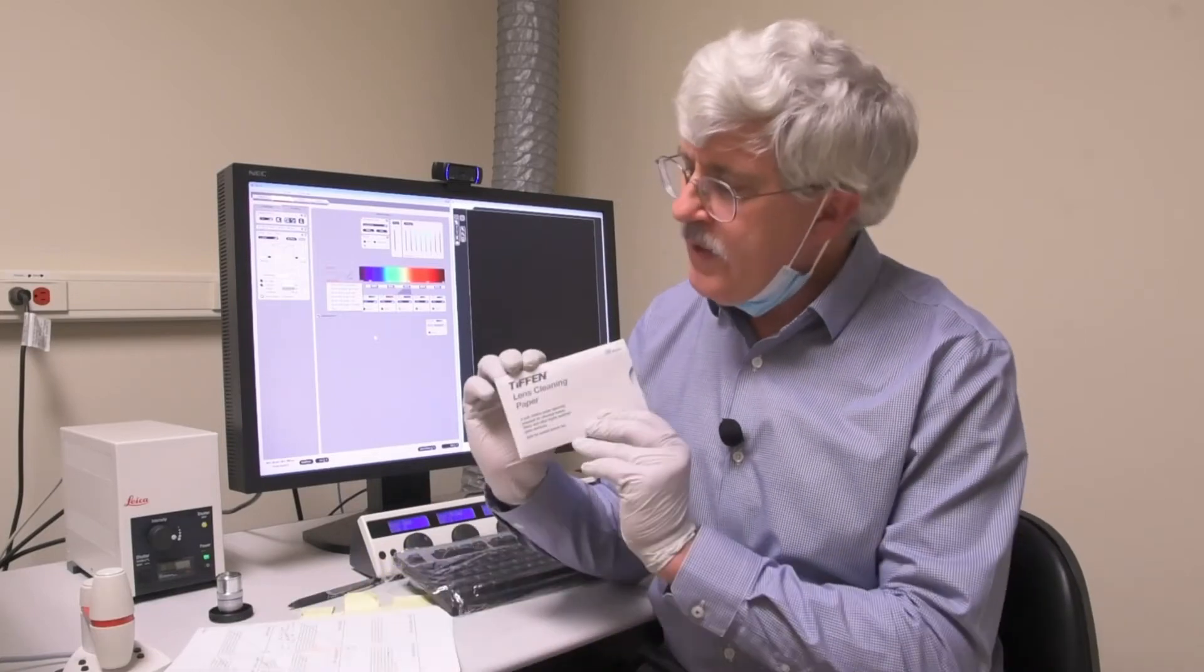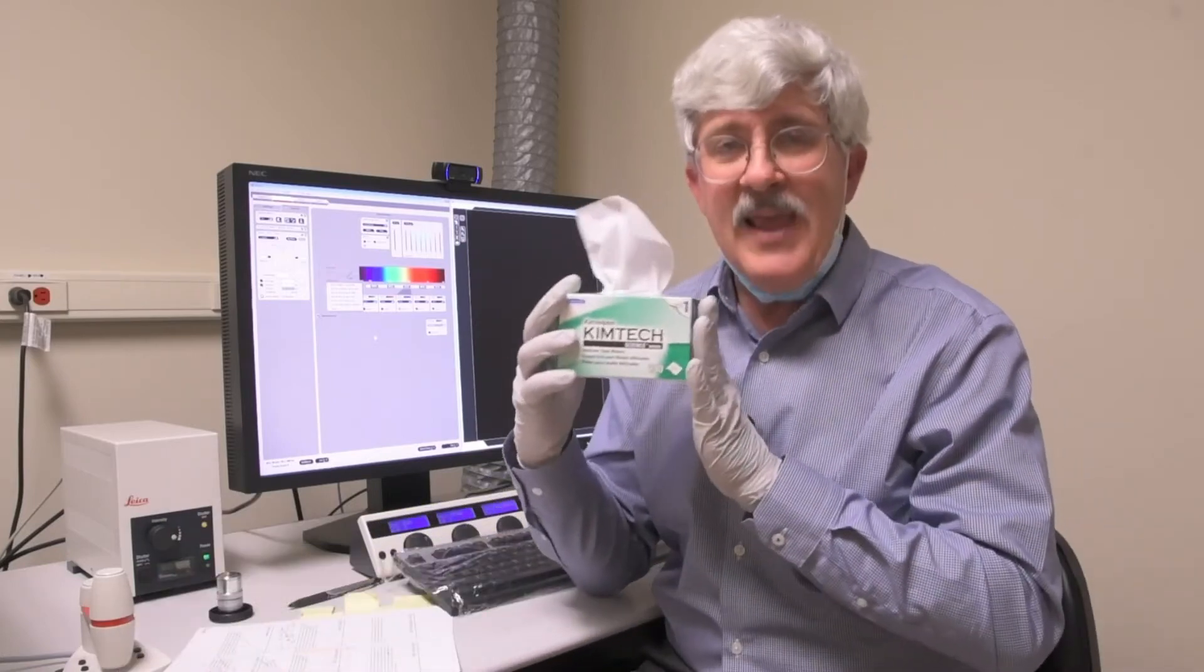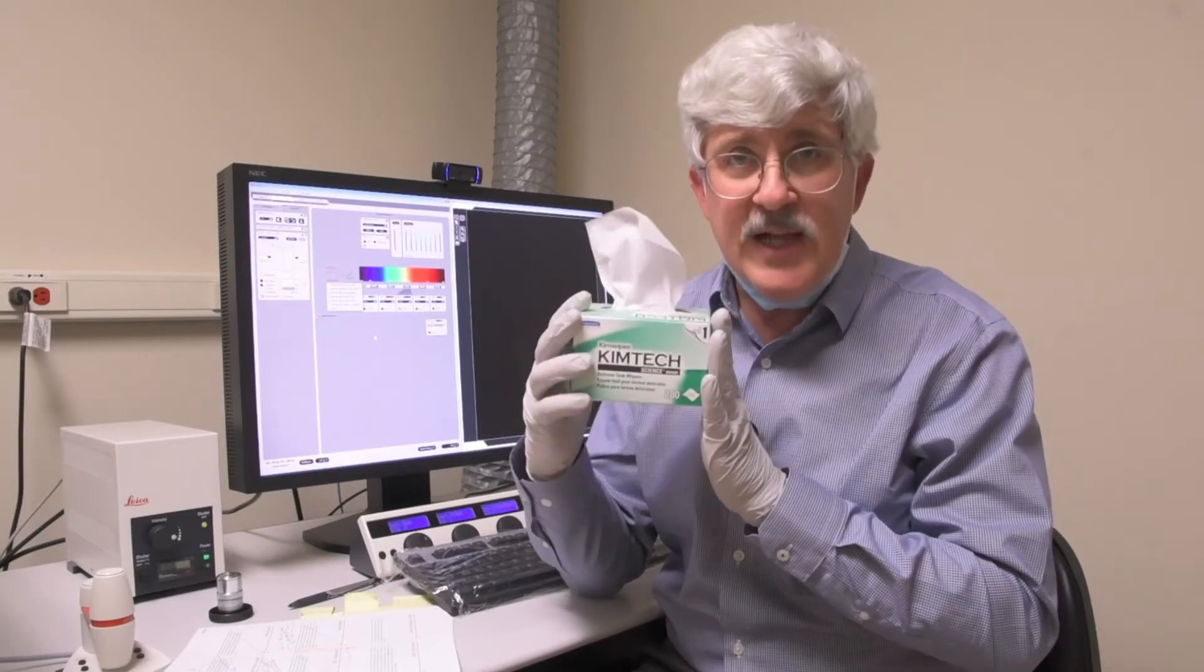I should mention that we do not want you to try to clean any of these objectives yourselves. If you think there is a problem, please let us know and we will take care of it for you. The most you will ever do is just wipe off any excess oil at the end of the day. Don't do anything more than that. When you do, you will only be using lens cleaning paper or lens tissue. Never, never, never use kim wipes on any optical surface on a microscope. You can permanently scratch the objectives.